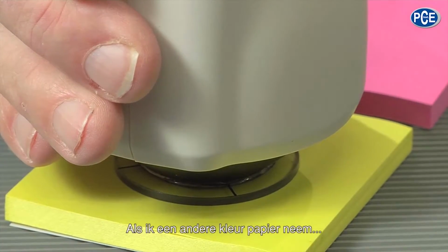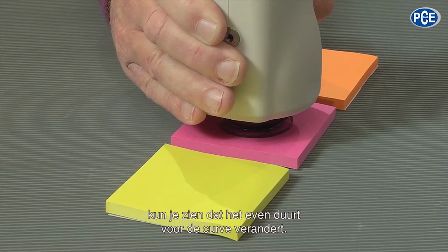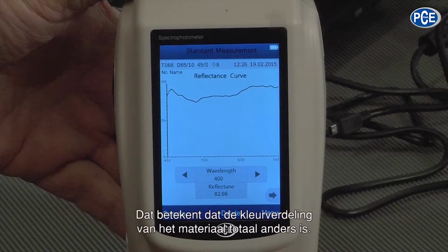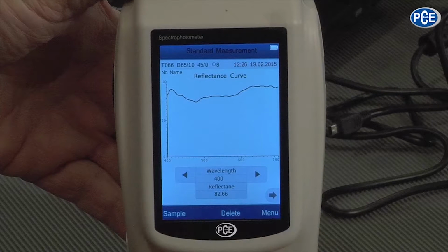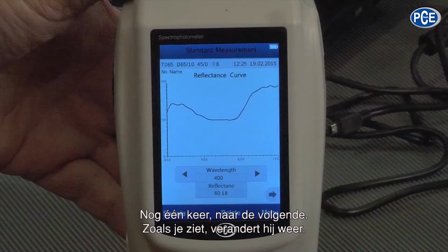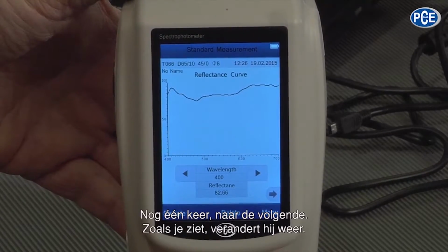Now when I go to a different colored piece of paper, then you can see it takes a little while how the curve changes. That means that the color displacement in the material is totally different. The absorption and reflection is different. So now one more time to the next one, and as you can see it changes again.